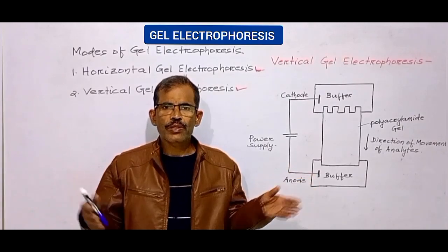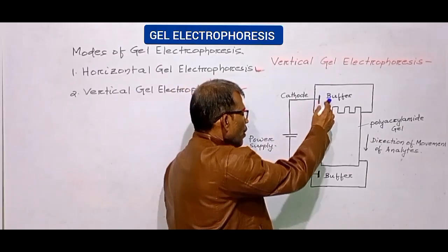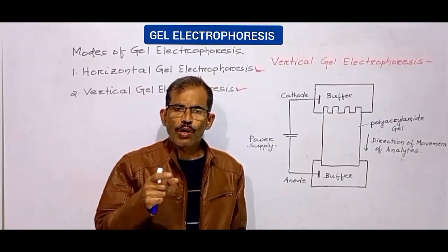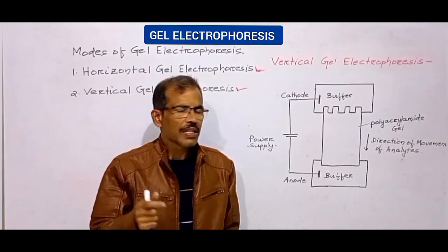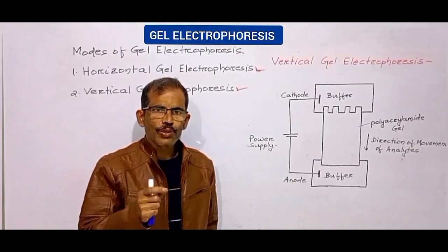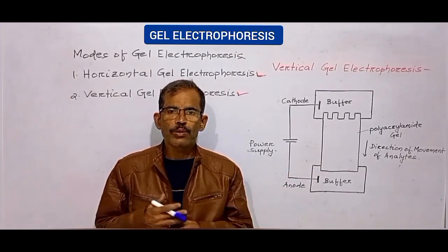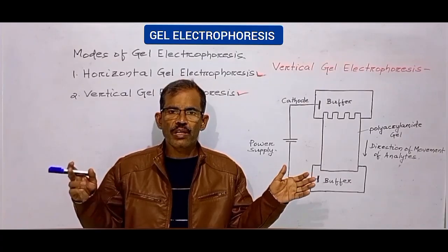During electrophoresis, a small amount of buffer travels from the upper to the lower buffer reservoir only through the gel. This allows for precise control of the voltage gradient. This, along with the small pore size in the polyacrylamide gel, makes this technique highly suitable for the separation of a mixture of proteins. Several proteins of biological importance consist of more than one polypeptide chain.